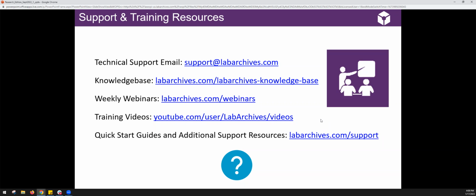Even though we have an hour today, I won't have a chance to cover everything. But we have webinars, which are publicly available. Anyone can register for. We have a YouTube channel. We even have quick start guides and more available for you all to learn more about different tools and features. So do feel free to reach out to some of those resources. And of course, the folks online today who are from Weill Cornell are great resources to reach out to on guidance, best practices, recommendations, and kind of building that community. The best person to reach out to for advice, someone beside you, someone at the institution. So there may be someone at Weill Cornell who could say, hey, I've done that, and here's what I did, or could give that kind of more hands-on feedback and advice.